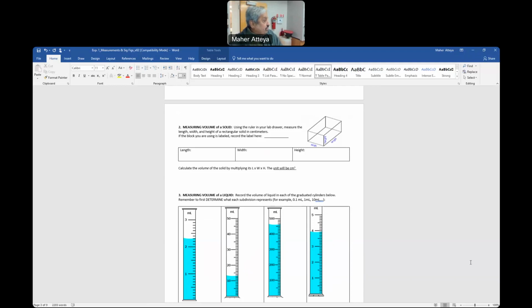You don't have to print. The only thing you have to make sure is that your file is at 100%. That's when you print it, it will be the same thing. You can see at the bottom of the Microsoft Word there is a scale, a slider there, higher or lower. So make it 100 and measure.